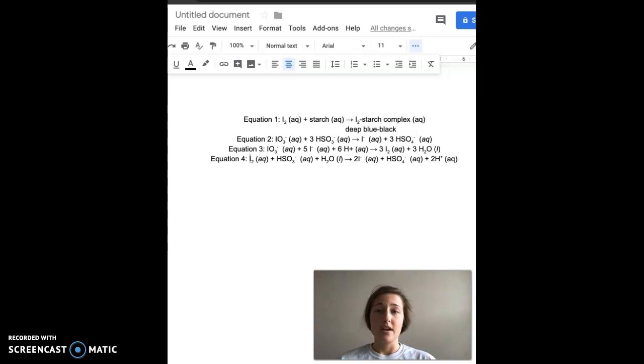The experiment focuses on the reaction of iodate ion, IO3, with an acidified solution of sodium bisulfite, or NaHSO3, containing the starch indicator. The reaction occurs in 2 steps. The first step generates iodide ion, the I in equation 2, which occurs slowly and is the rate-determining step. A rate-determining reaction is the slowest step in the reaction mechanism and is assumed to be equal to the overall reaction rate because the reaction cannot go faster than the slowest step.